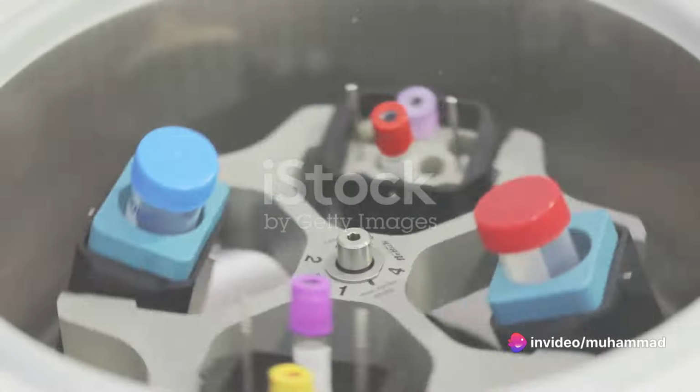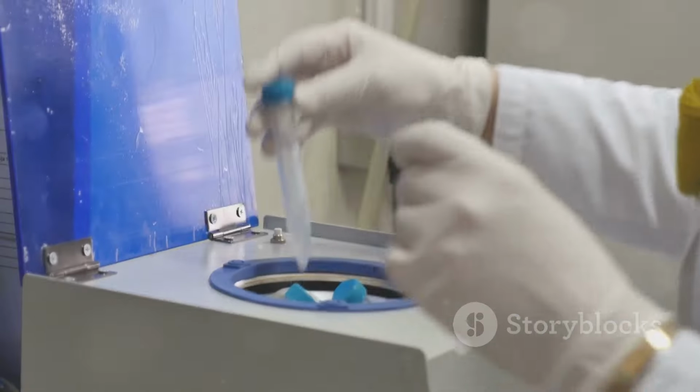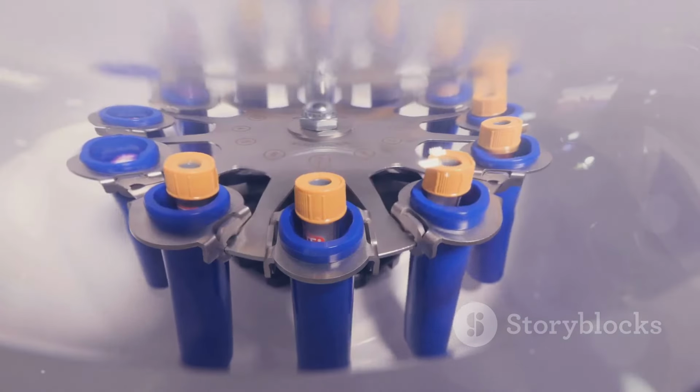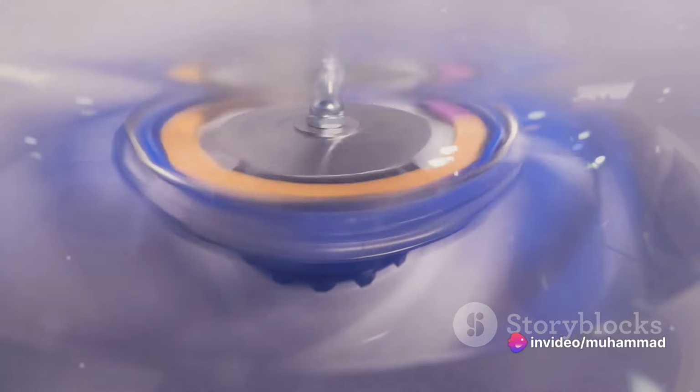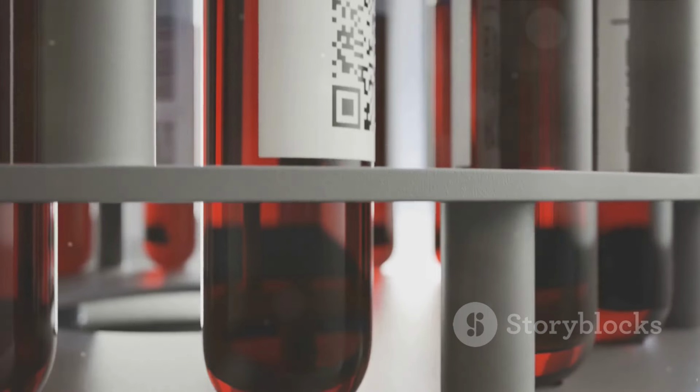Next, the homogenate is subjected to a process known as differential centrifugation. This process involves spinning the homogenate at different speeds and for different durations. The idea is that the heavier components will settle at the bottom first, forming a pellet, while the lighter ones remain suspended in the solution, which we call the supernatant.